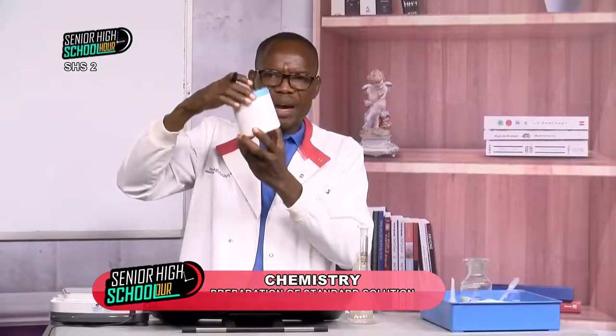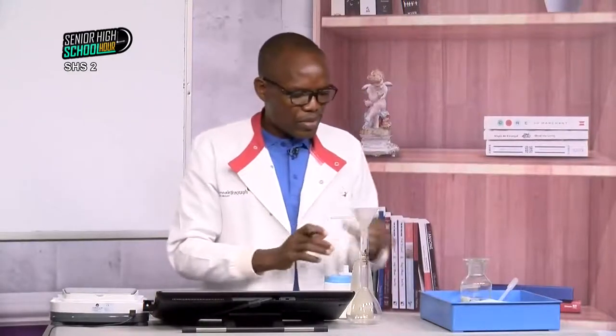What do I need to transfer the solution after dissolving in a little amount of water? Oh, I have a funnel to do the transfer like that. You see, good. What else do I need? I need to weigh, so I can have a little beaker. Please note that the beaker should be clean and dry. Then, of course, because we are learning, I'll also need a dropping pipette to top up the solution to the mark there. Are we set? Yes. Can we continue?